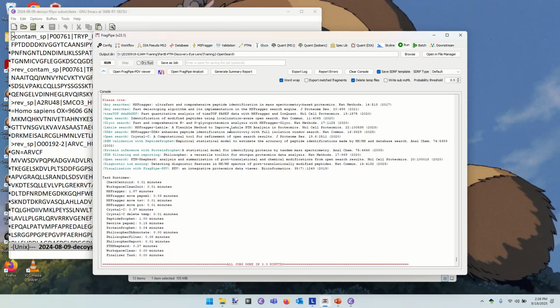Proline oxidized has the same mass as leucine. So if you tell the software, I'm looking for only this type of modification, you have to be careful that there aren't other explanations for that same mass shift. If you have 156 added to the C-terminus and the next residue is arginine, that's probably a safer explanation than an actual modification of that mass.